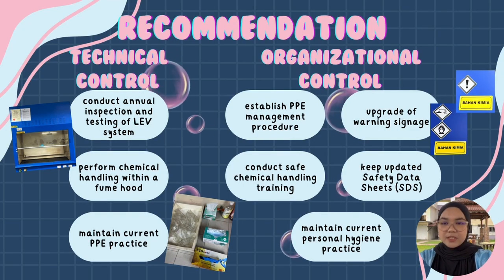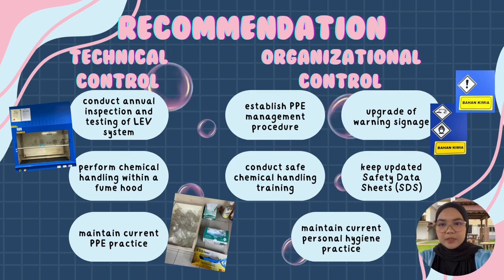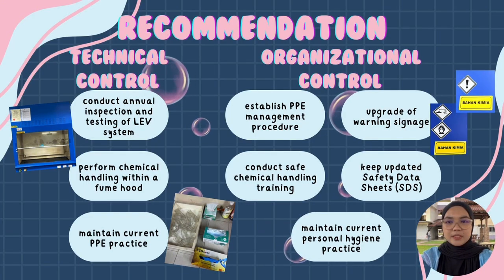Next, the person in charge must keep an updated SDS and chemical register in the workplace, because we have received an expired SDS and incomplete chemical register during the assessment. Chemical register must be immediately updated when a new chemical is brought in or change of suppliers, and an up-to-date SDS helps during emergency like chemical spills or any exposure occur. Last but not least, the laboratory has a strict prohibition for eating, drinking and smoking. Fortunately, all the staff and students comply with the established rules, so they just have to maintain the current practice.